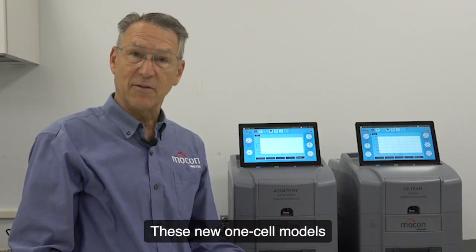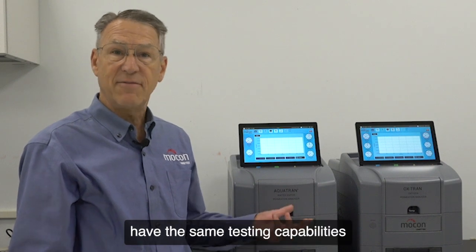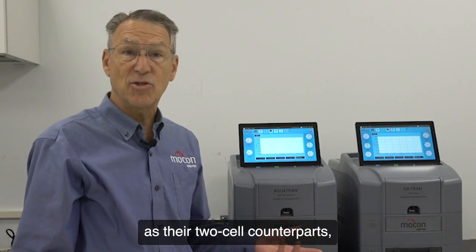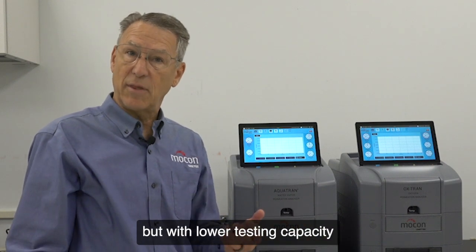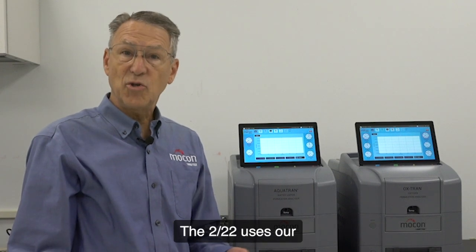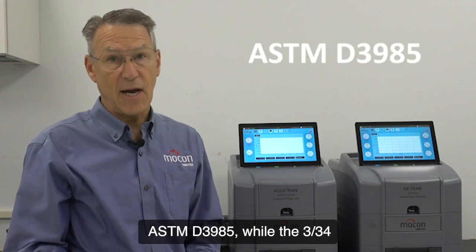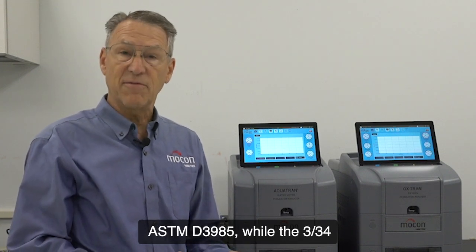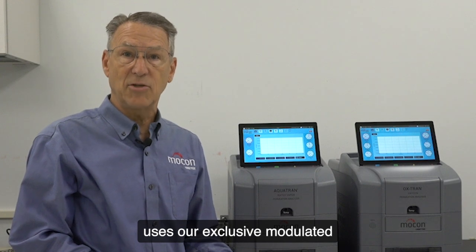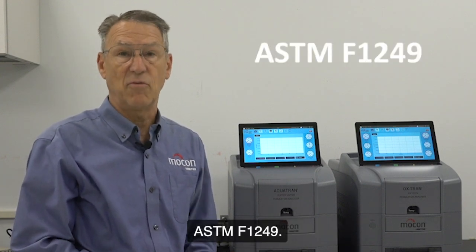These new one-cell models of our Oxtran 222 and the Permatran 334 have the same testing capabilities as their two-cell counterparts but with lower testing capacity at a fraction of the cost. The 222 uses our patented Coulox sensor letting you test to the common ASTM D3985, while the 334 uses our exclusive modulated infrared sensor letting you test to ASTM F1249.